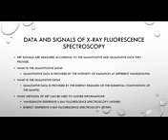There are two X-ray fluorescence spectroscopy methods that can be used to gather information. The first method is wavelength dispersive X-ray fluorescence spectroscopy. This method is older and can only measure the wavelength of an element, one element at a time. The second method is energy dispersive X-ray fluorescence spectroscopy. This method can collect information of multiple elements in a sample at once and can also provide better energy resolution.